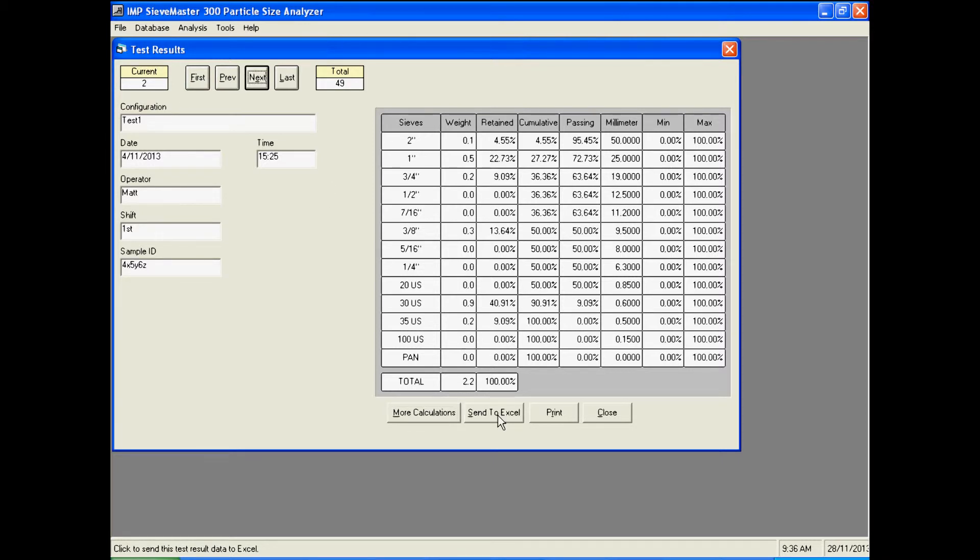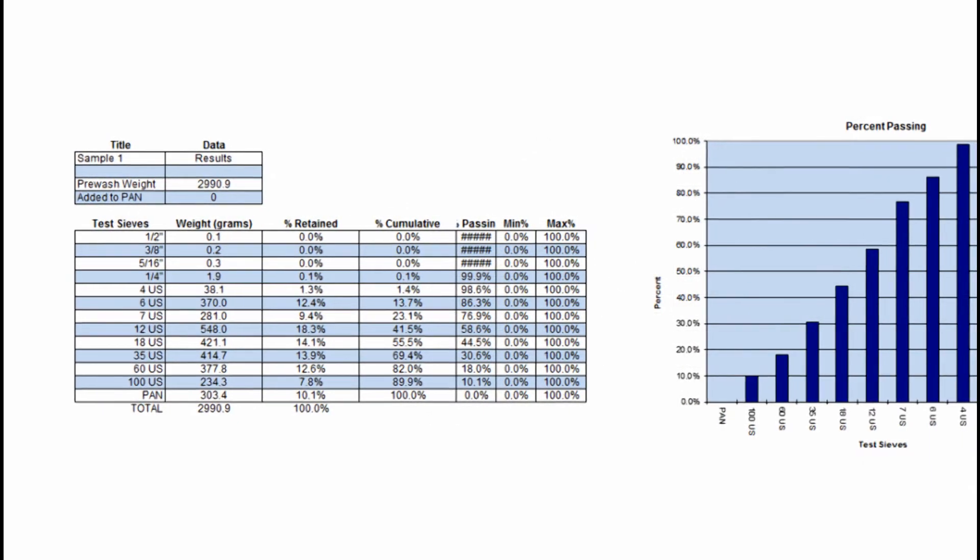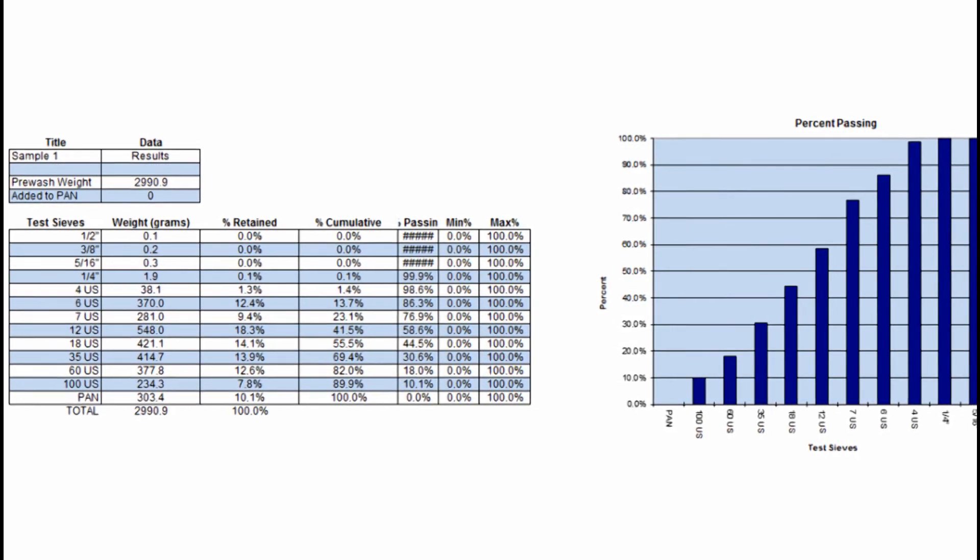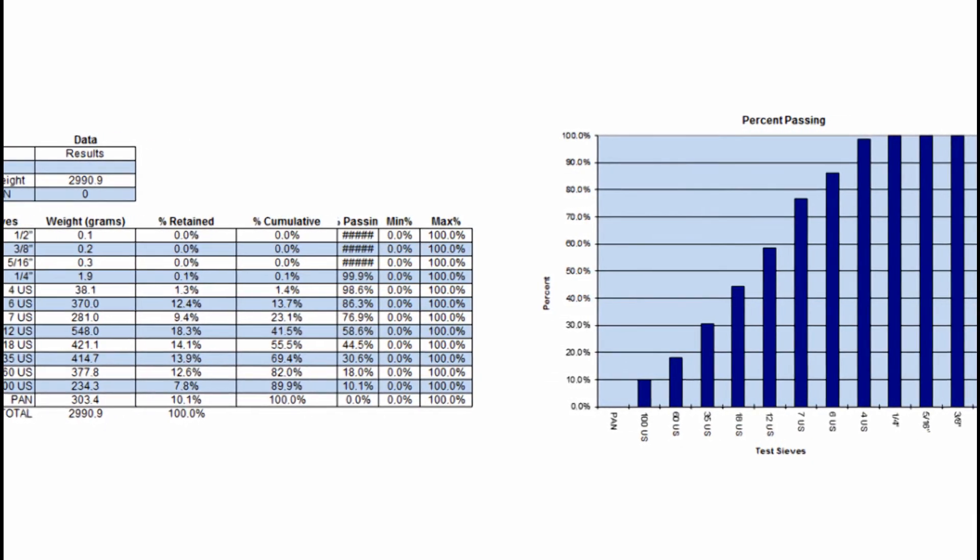Flexible reporting options alongside customizable Excel spreadsheets ensure the results are always presented in the most relevant way.